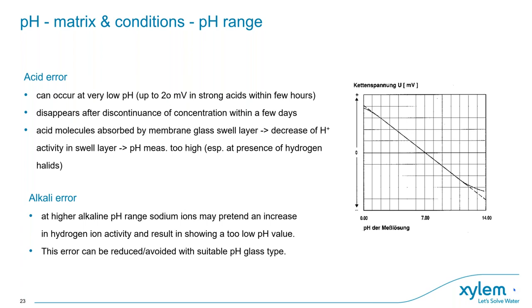For extreme pH values, the literature describes the so-called acid error and the alkali error. While the acid error is observed rarely, the alkali error occurs in a very alkaline range — around pH 13 or 14. High concentrations of sodium ions may mimic an increase in hydrogen ion activity, resulting in displaying a lower pH value than the true value. This alkali error can be reduced or avoided by using a suitable membrane glass type, which we will see more about later.